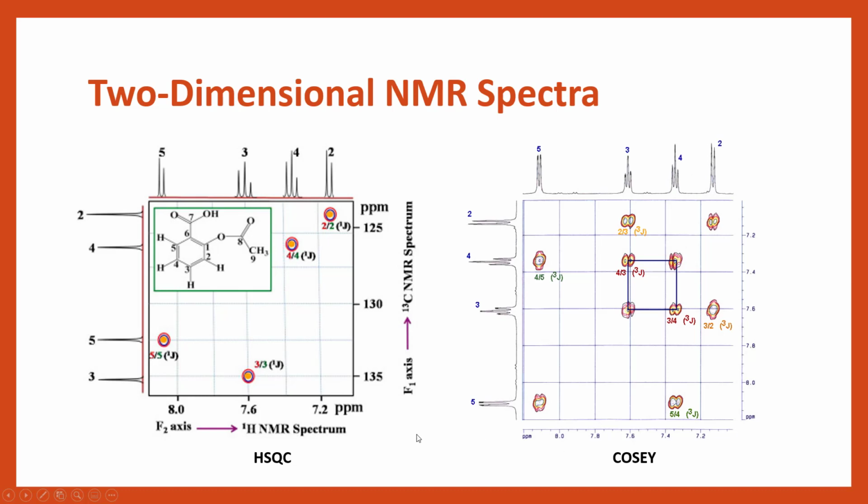Okay, so NMR spectroscopy, there's loads of interpretation with it. What I'll do is I'll put up some examples of spectra and see if you can determine the structures. And we'll obviously be going through this in our online lab next week as well.